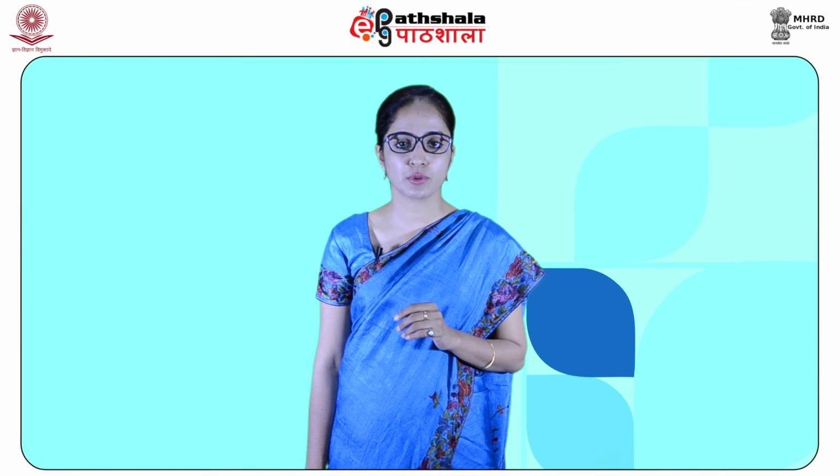Now, 19F is the naturally occurring isotope of fluorine, with 100% abundance. Phosphorus 31 NMR spectroscopy is used to identify phosphorus containing organic and inorganic compounds. The 31 phosphorus has an isotopic abundance of 100% and a relatively high gyromagnetic ratio, 40.5% that of proton. Like fluorine and proton, it also has a spin of 1/2, thus making the spectra relatively easier to interpret.